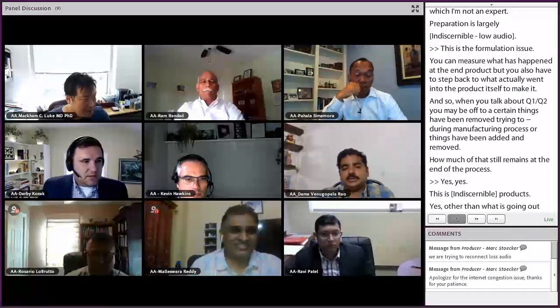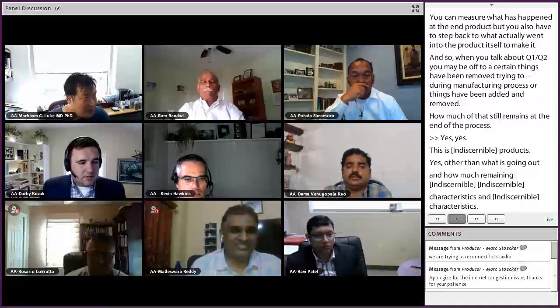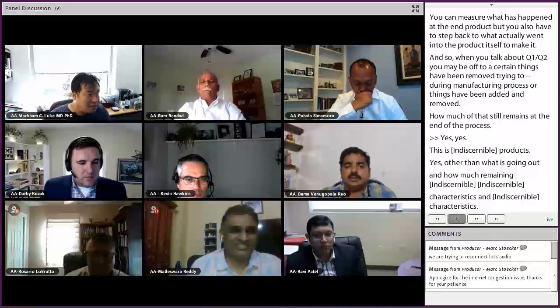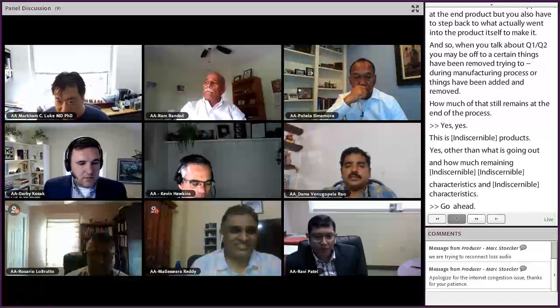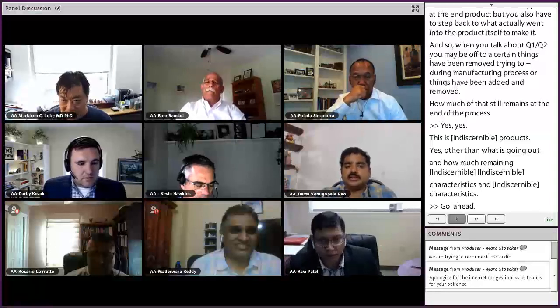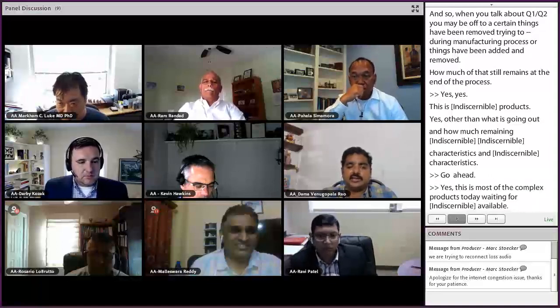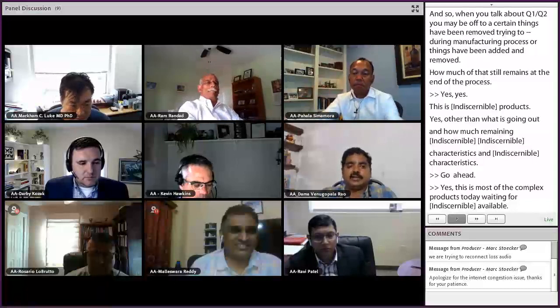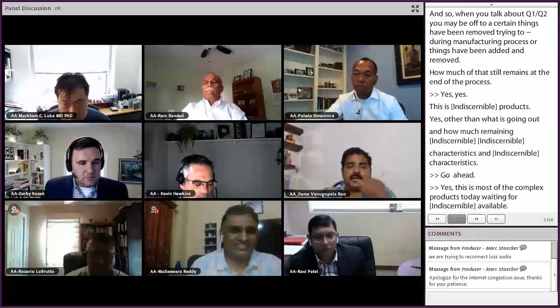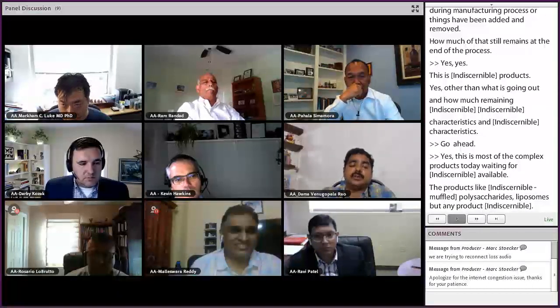Yeah, Markham, as Dr. Reddy mentioned, most of the complex products today have public literature and research available. For the majority of products, whether glycosaminoglycans, polysaccharides, microspheres or liposomes, the end product characterization is very clear. Most people know what is needed and which analytical techniques are required for characterization. But the interesting thing is that the majority of these products are product-by-process.